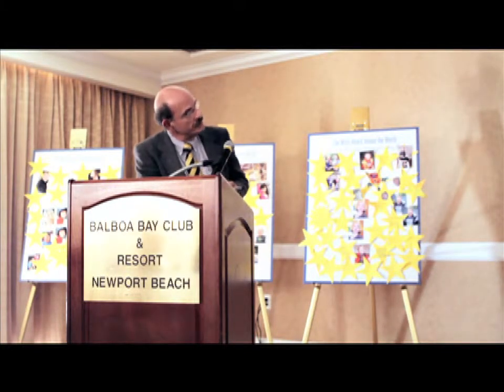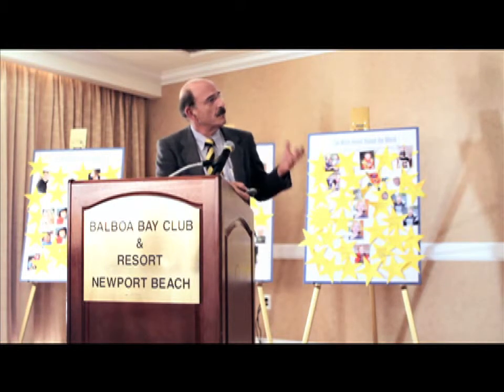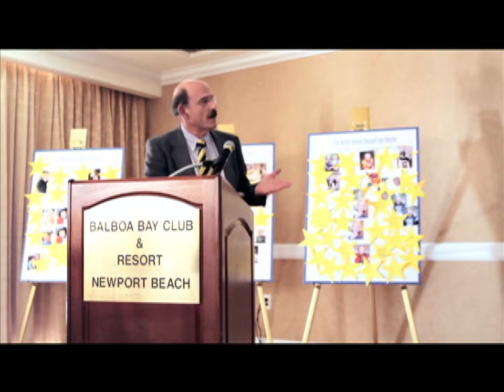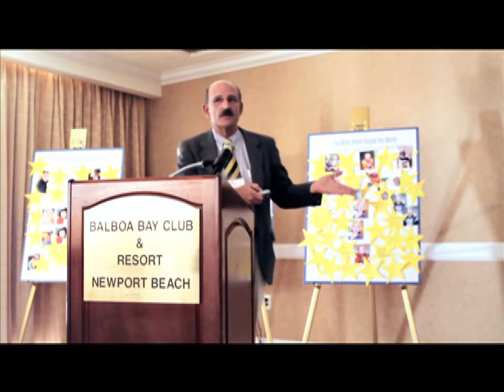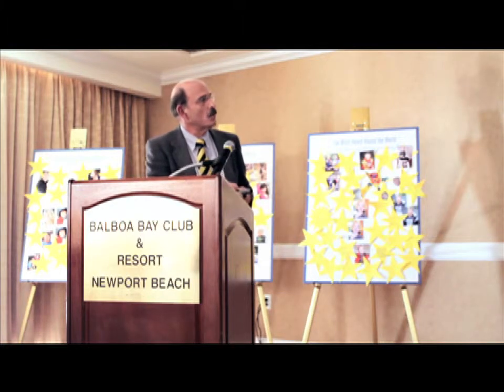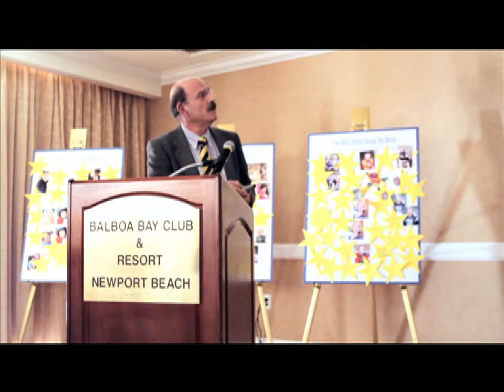And if you look here, here's a high power magnification. This is a dendritic keratocyte, and it's labeled with this red dye, indicating that this was one of the cells that was initially injected. It was a mesenchymal stem cell that now has become a keratocyte. In fact, we've gone on and shown that these cells express markers of keratocytes. They express the correct proteins, extracellular matrix molecules that are important for keeping the cornea transparent. So we have a preliminary study. We've only got 10 weeks out. We don't even have a quantification, but I wanted to present this.